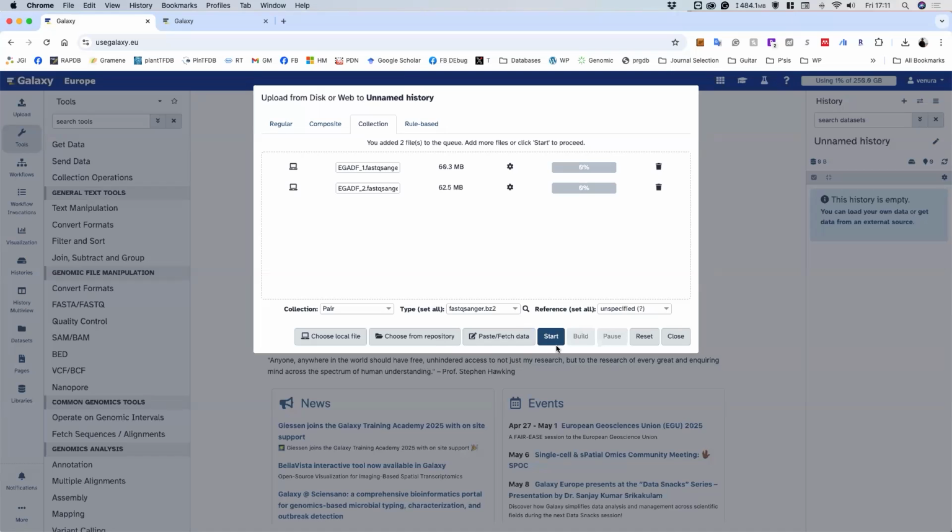So if it's already uploaded, what can I? Yeah, so there's a workaround. I'll show you in a bit. Give me 1 second.